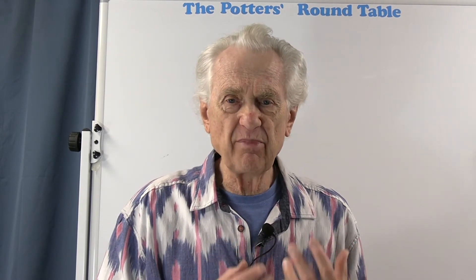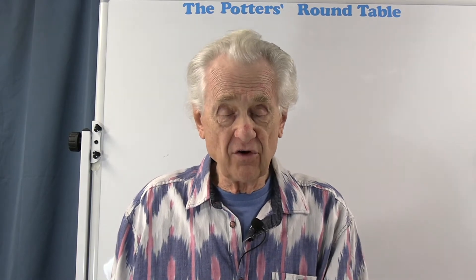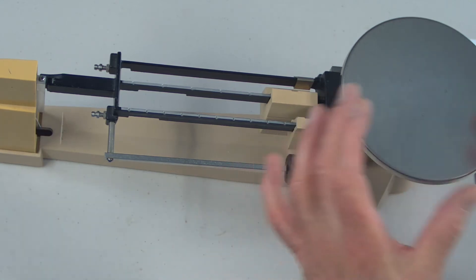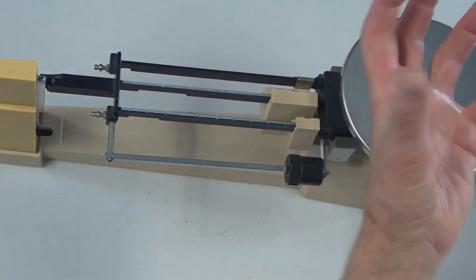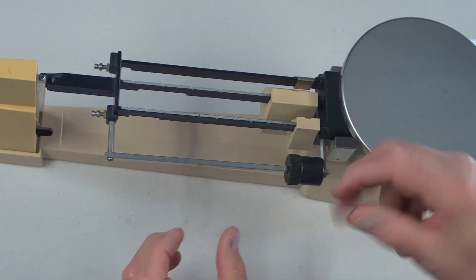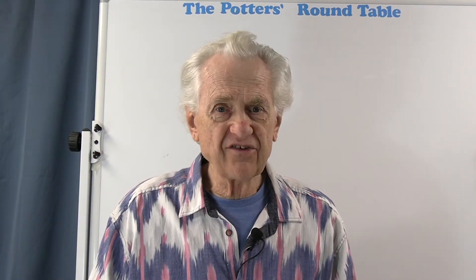The sliding weight is used to balance out the weight of an empty container on the pan. If I'm doing a lot of repetitive measurements and I don't want to subtract the weight of the pan from the total, I can use this tare weight to balance out the weight of the pan so that every time I weigh, I'm just weighing the material in it. You put the container on the platform, slide this large weight to the approximate location, then twist it slightly to make the final adjustment.